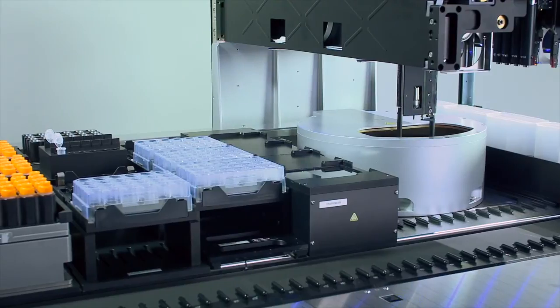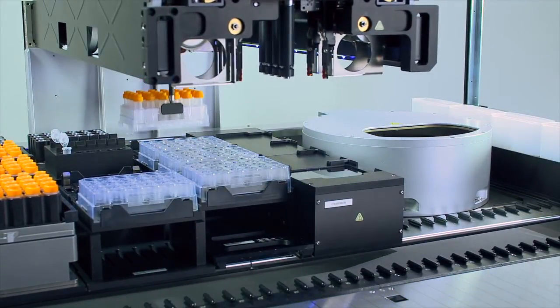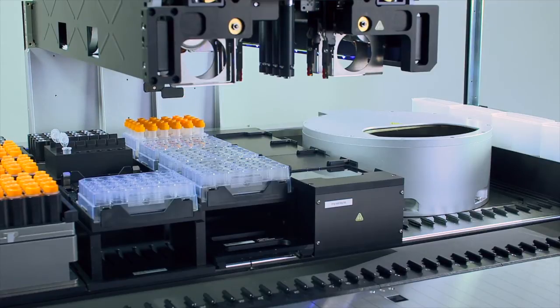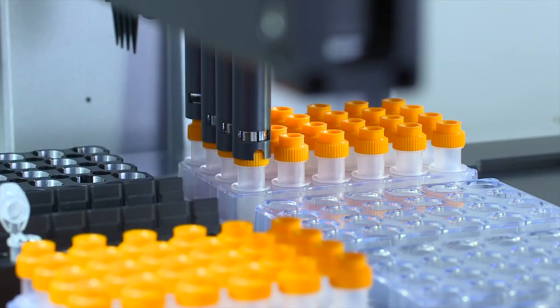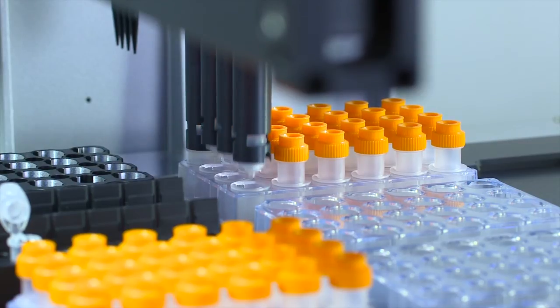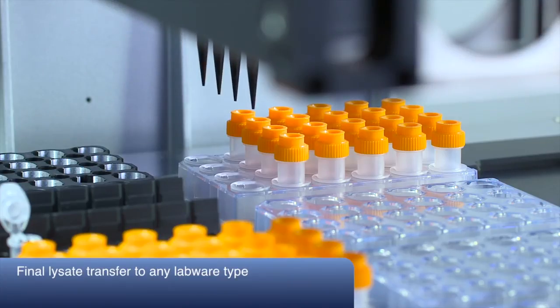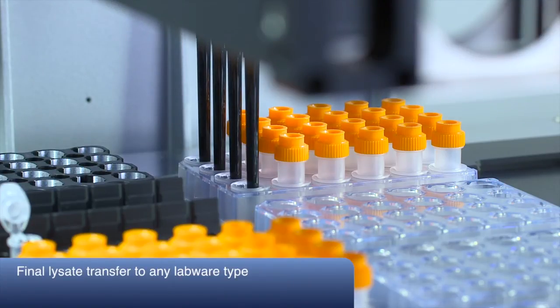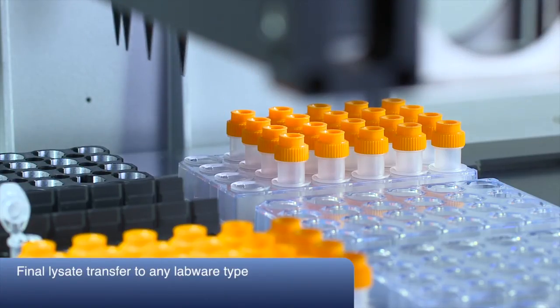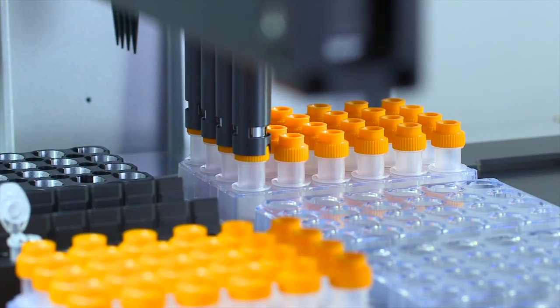After centrifugation, the racks are transferred back to their original positions on the robot deck. To access the clear lysate, the inner tubes are lifted and removed. The pipetting channels then transfer the clear lysates from the outer tubes to the destination format of your choice, for example, tubes or plates. The sample lysis process is now completed.